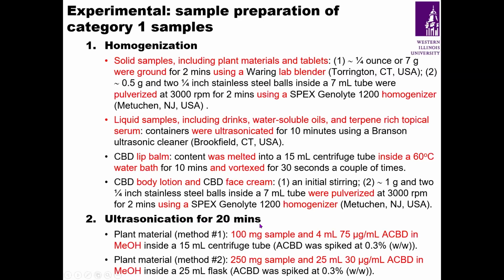Ultrasonication for 20 minutes after an appropriate amount of the sample, an appropriate volume of methanol, and an appropriate amount of abnormal CBD are spiked into the mixture.